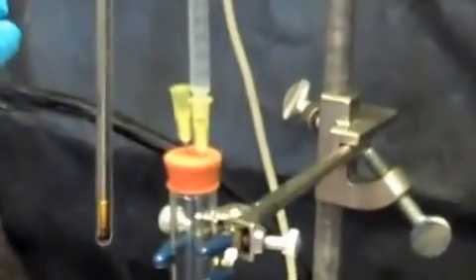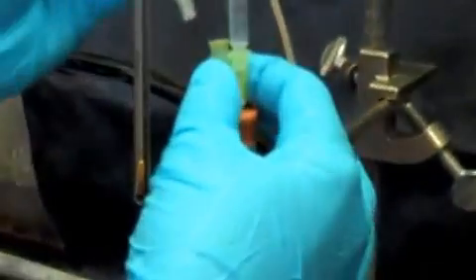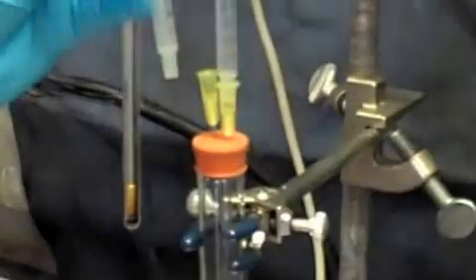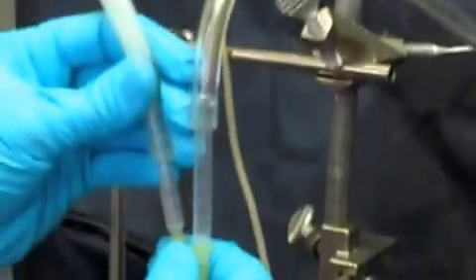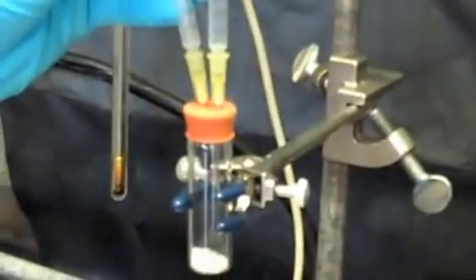We can also check that the nitrogen is flowing through our flask by hooking up this needle that's attached to oil in a bubbler. There's just a little pipette that we've placed into the oil, and when we put this in, we should see it bubble.